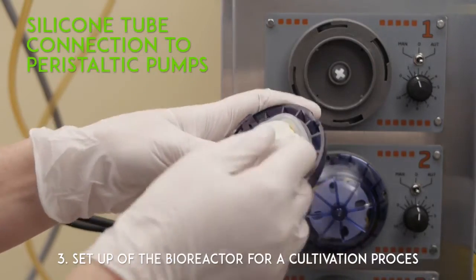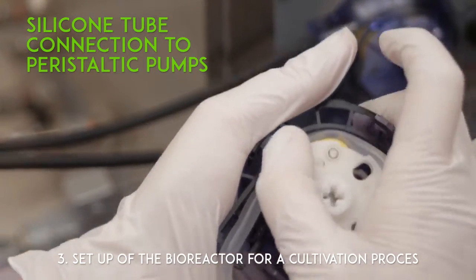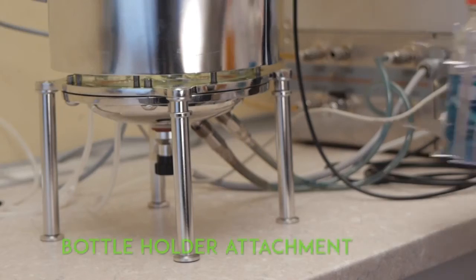Connection to peristaltic pumps. Bottle holder attachment.